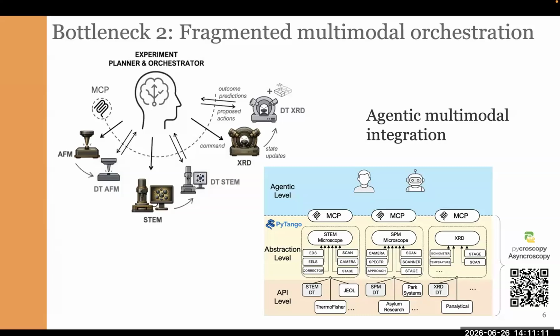So what is our vision is to organize the whole process, the whole automated experiment, not on the level of some specific modality, but rather to move to the point when we can orchestrate the whole process centrally.